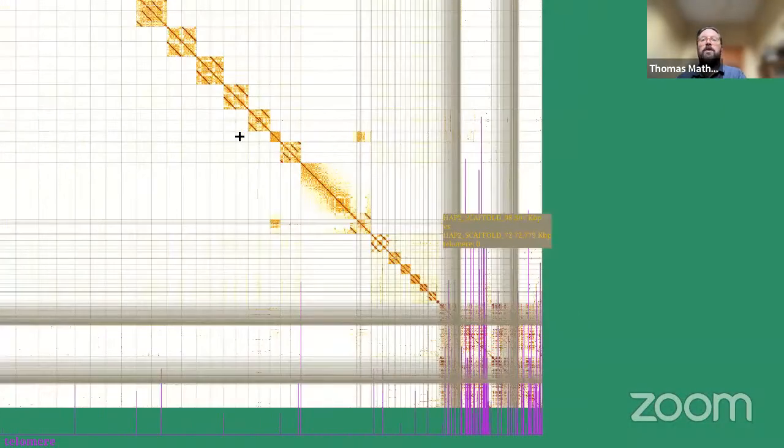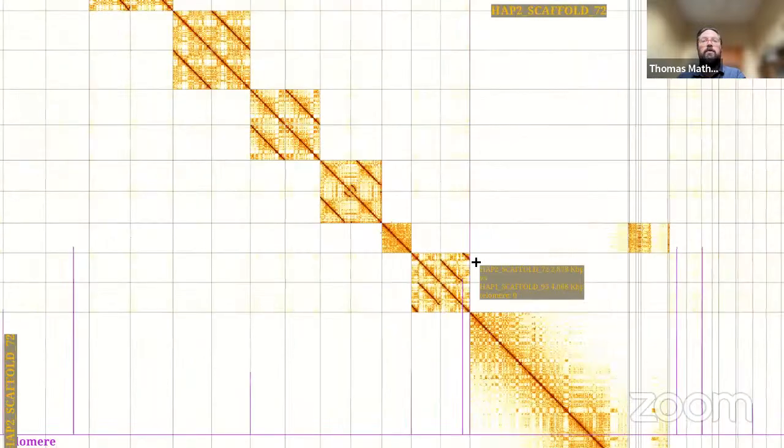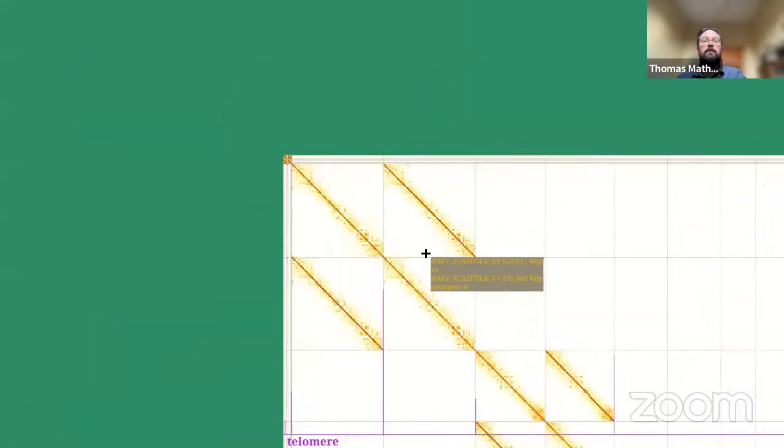Okay. So what I would do is I would go through this assembly, place as much as I can within each individual chromosome that I can see. This looks like it's a piece of the sex chromosome. So keep moving stuff around. Now we'll go back to our microchromosomes. So these are basically the smallest chromosomes which we want to try and identify.